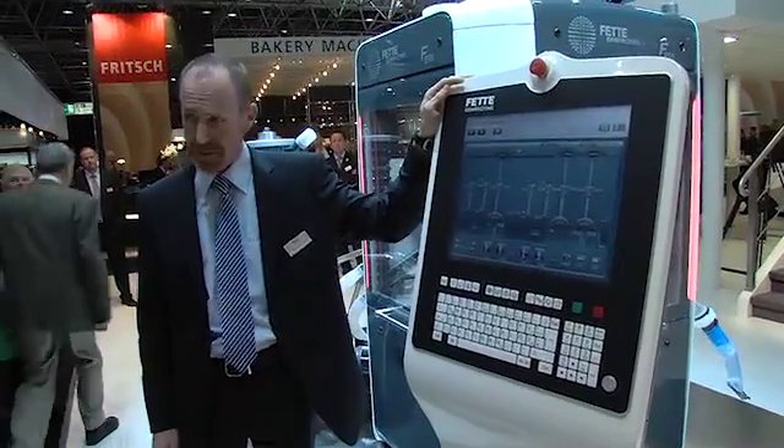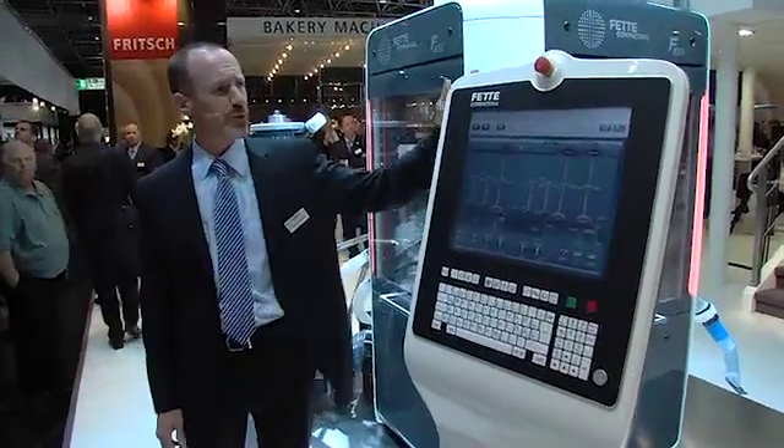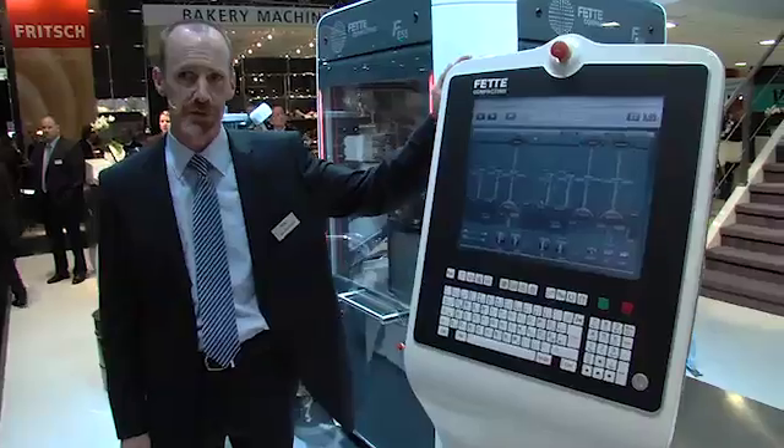At this point, I will turn it over to Herr Bommowitz, who will prove to you that the FE55 really does make tablets.